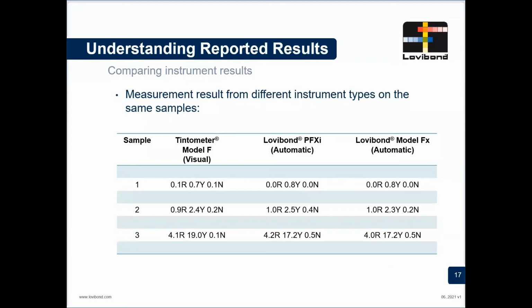So let's look at some real samples. Here I've measured 3 samples at 3 different levels, a sort of low color, medium color, and a high color. And you can see that between the visual instrument, PFXI, electronic instrument, and a model FX electronic instrument, the results are similar, but they're not quite the same.